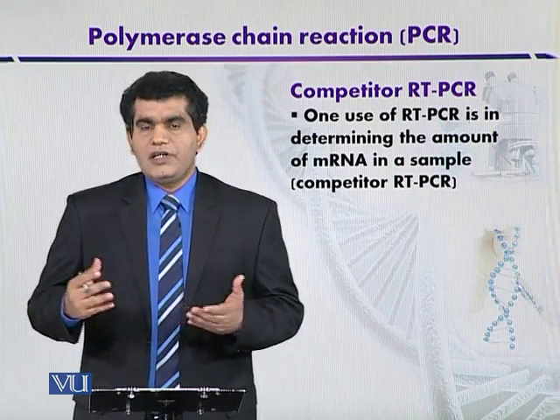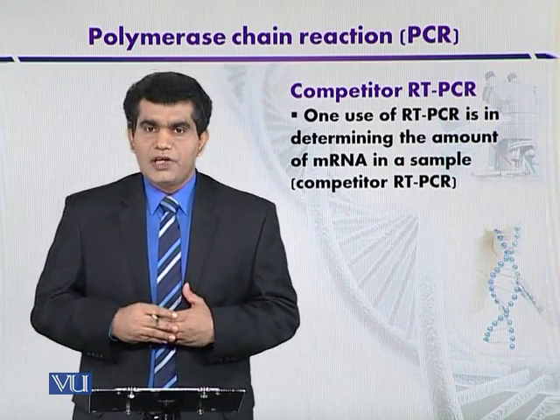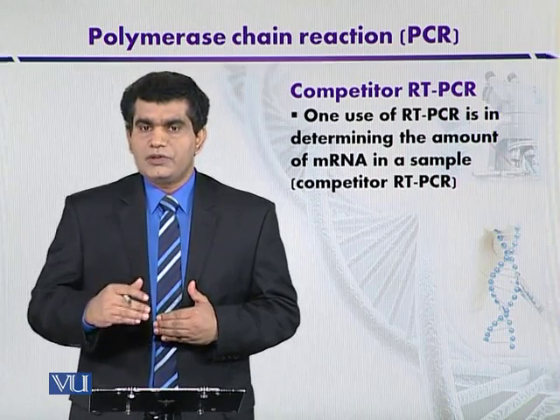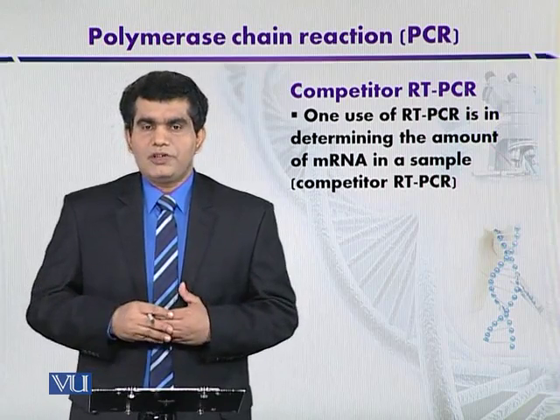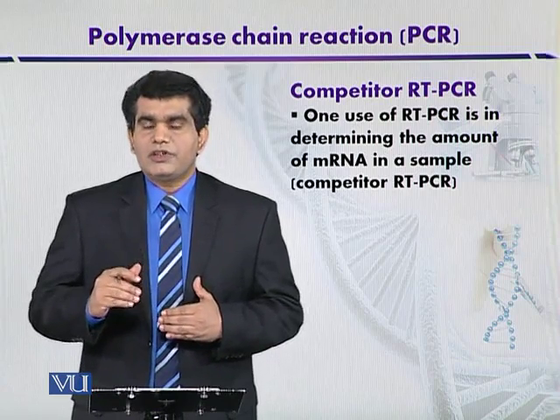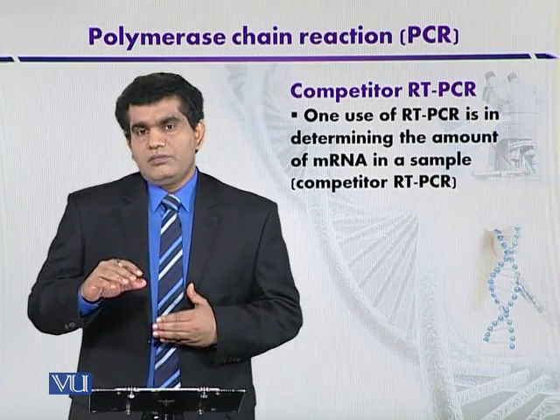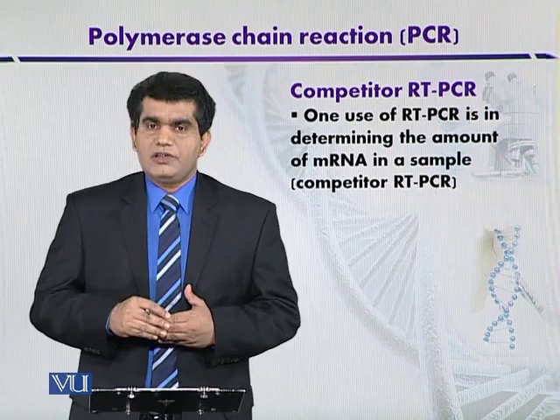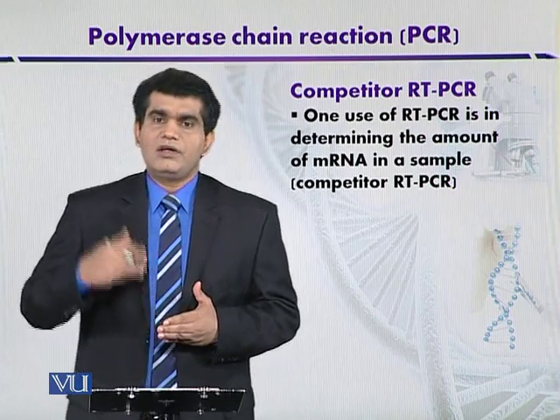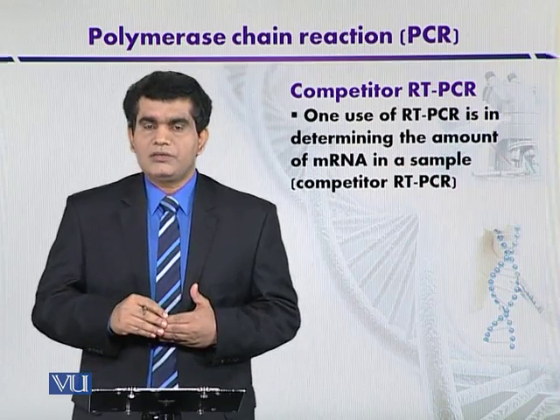So if RNA is there and because of such inhibitors we can't see it, we don't have any quantification. So to eliminate such chances, one can use synthetic RNA molecule, that is competitor RNA. Because sometimes if we are going to diagnose certain pathogens like hepatitis B virus, then if RNA inhibitors are there, one of the example may be like RNases, either exogenous source or endogenous source. So although virus is present, RNA is there, but it is degraded.